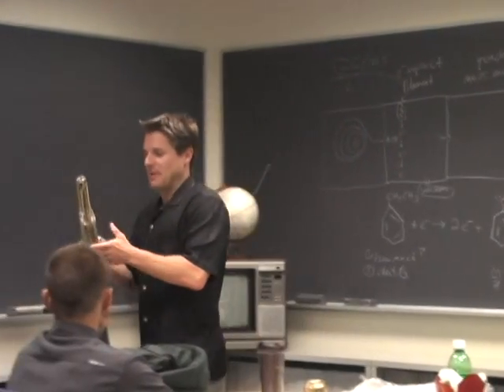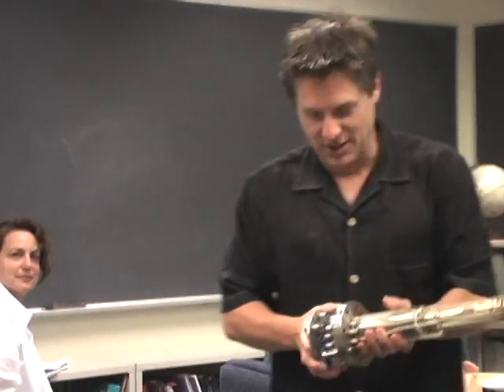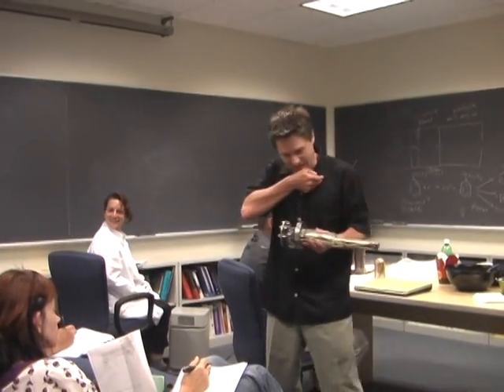Some people get the wrong ideas with this, but it's got a bunch of wires on here. Greg was giving me a real hard time with this. I won't say what I said and how he took it, but anyway.